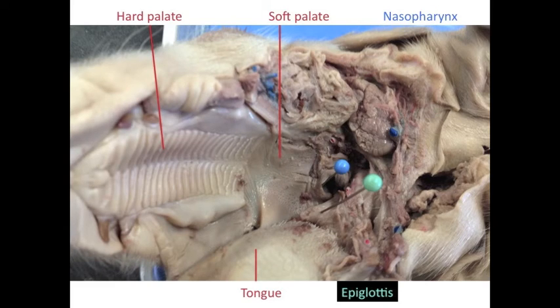This is the oral cavity of the fetal pig, anteriors to the left. The ridged structure is the hard palate, and just posterior to that is the soft palate. Posterior to that is the opening that leads up into the nasopharynx and the nasal cavity. The tongue is labeled there on the bottom, and the epiglottis is the structure that can close and block off the trachea.